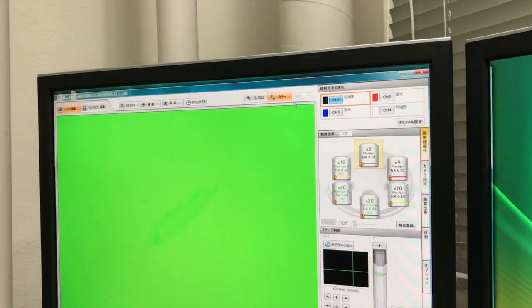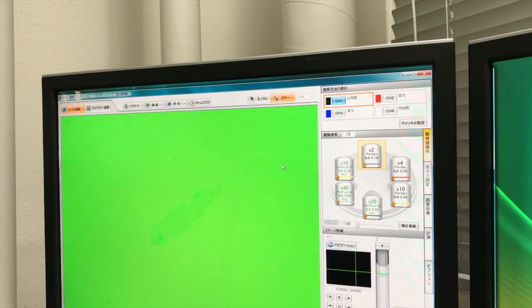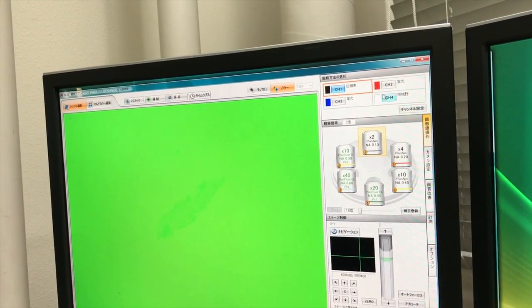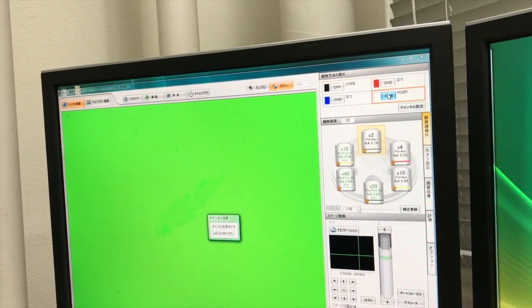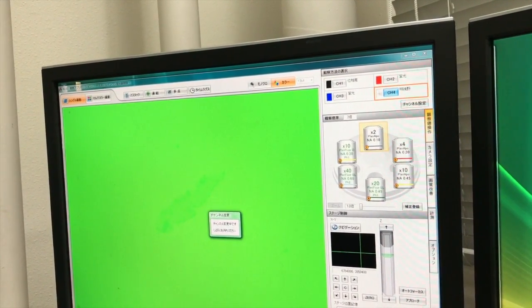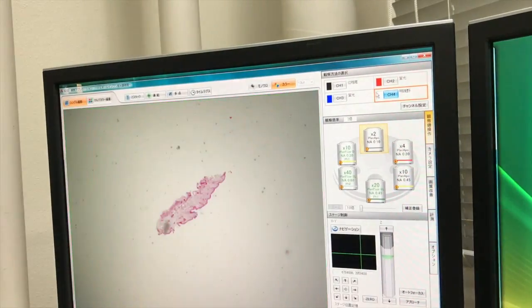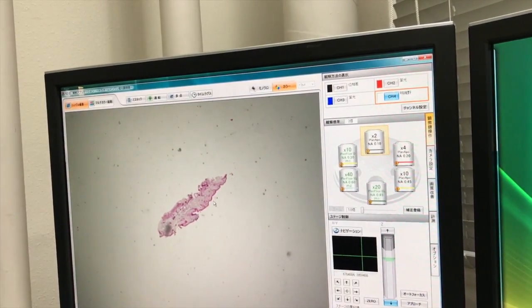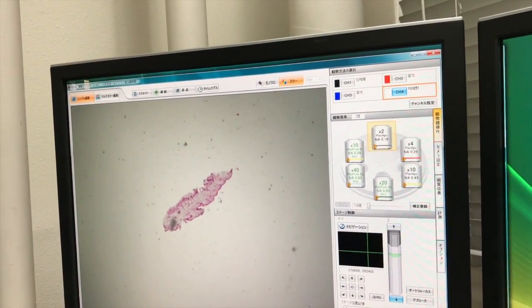Please say I'm sorry. Why green? Let's wait. Because it's switching to channel also. You only have to use channel 4. Yes. I need like this.